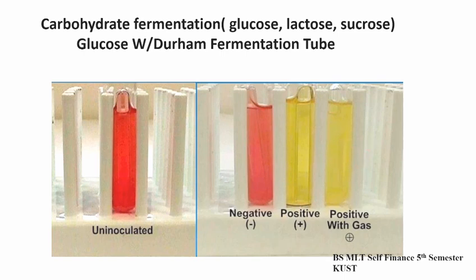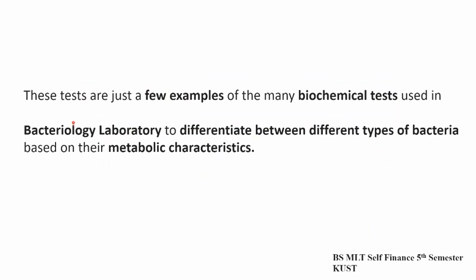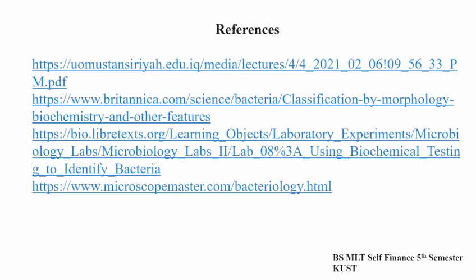Okay, this is the summary. These tests are just a few examples of many biochemical tests used in the bacteriology laboratory to differentiate between different types of bacteria based on their metabolic characteristics. These are the references.